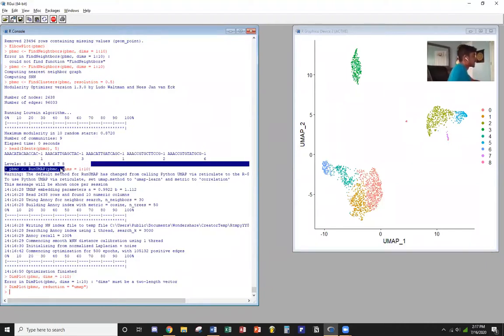And you can see here the beautiful UMAP and the various clusters. And so next, you can actually save this like this, saveRDS, and then put the variable name here, and then put a location like that. But I won't be doing that right now. I'll just continue on. So now there's multiple lines of code here, so I'll just type them down and then explain each one.